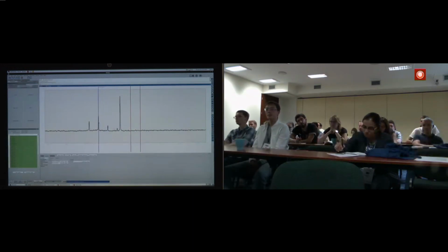Just imagine increasing our magic angle rotation. So for example, we can increase spinning speed up to, for example, 6 kilohertz. Then we would expect that the signal would remain stable, would be exactly at the same position, that one over here, which is isotropic.